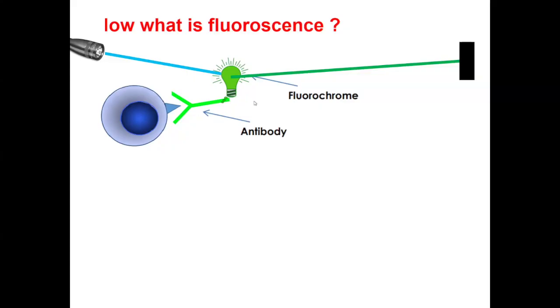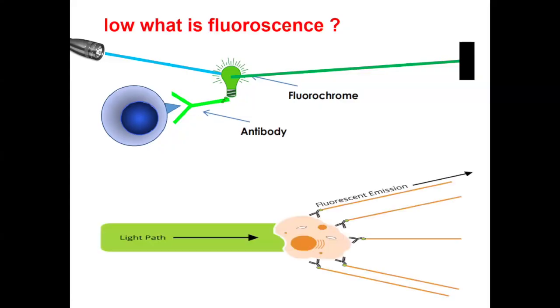And the beauty of flow is that, in contrast to your other immunophenotypic techniques like IHC, multiple antigens or proteins can be studied simultaneously in every cell. What I've shown here as an example is just one antigen. Similarly, you can study almost 13 antigens with a 13 color flow cytometer at a given point of time in one single cell. I have shown here 5 markers, but similarly, you can study 13 markers, 20 markers based on the configuration of your flow cytometer, right?